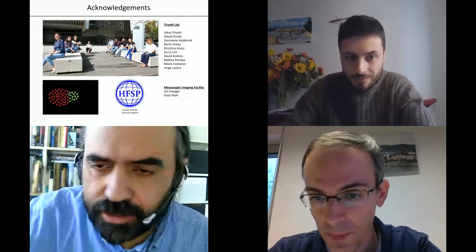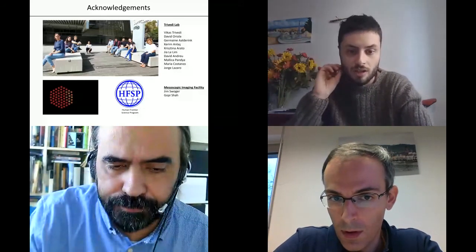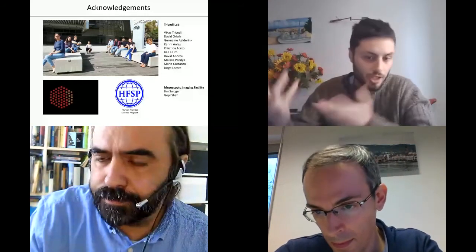Thanks a lot, Nicola. In fact, there is one question about if it would be possible to do cytometry with this kind of samples in the way that you can run this kind of screening with these automated flow cytometers. Yes, so there are commercially available software systems definitely to perform cytometry. I'm not sure if the question regards more the commercial system or the light sheet system, but in the case of the light sheet, of course, it's a little bit more complicated because of the configuration of the objective.